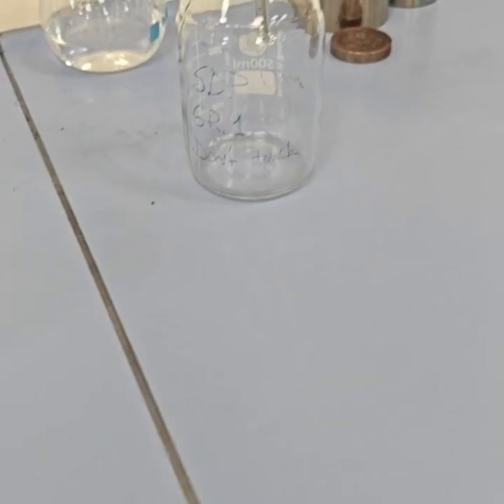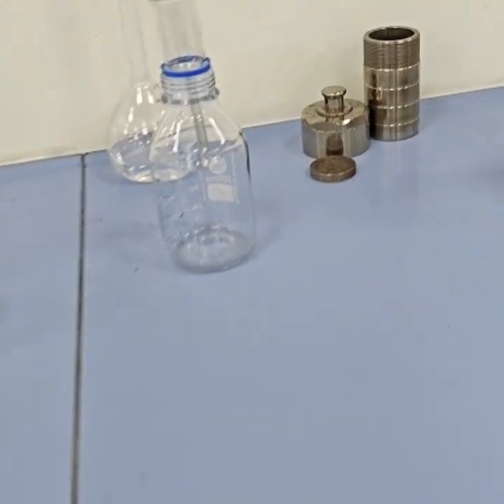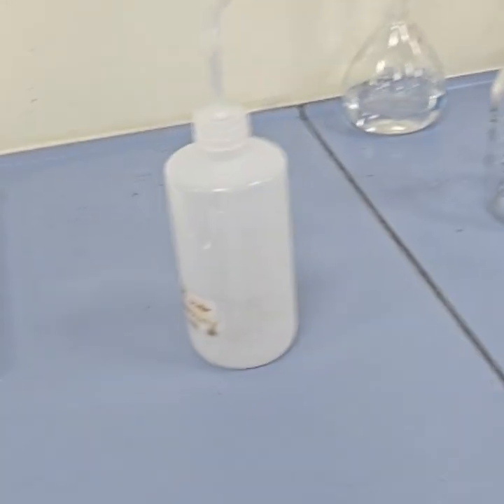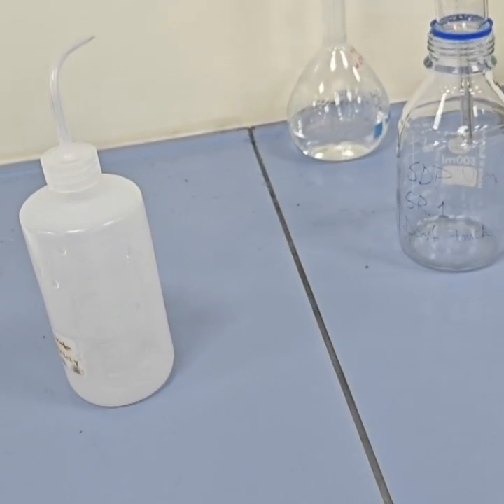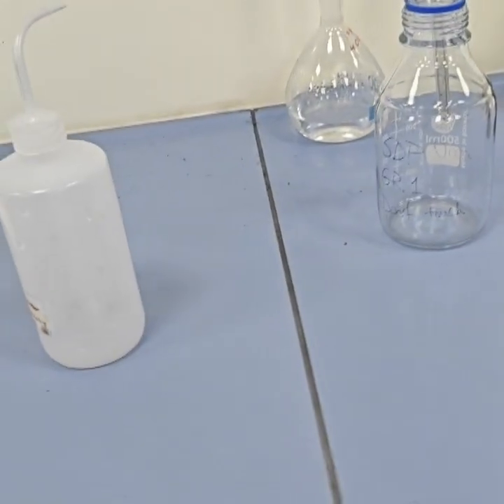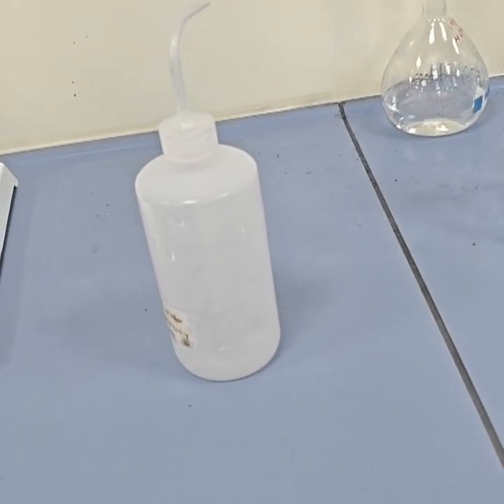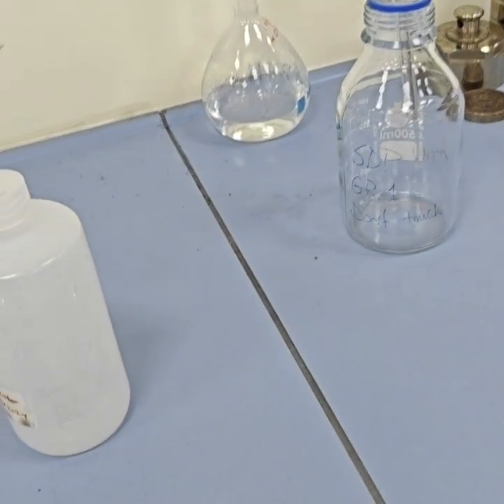Okay, so this is all about the protocols that we follow in the laboratory before doing any kind of analysis, whether you are finding the physical, chemical, or biological property of the water. These were the simple protocols that you must follow before doing any analysis. Usually the sample preservation is as per US EPA 40 CFR part 136, or you can also call that APHA 1060. In my next consecutive videos, I'll be talking about the protocols separately. For example, if you are doing pH, what should the protocols be? If you are doing BOD, COD, metals, nutrients, suspended solids, and the different kinds of analysis that we perform in the laboratory.